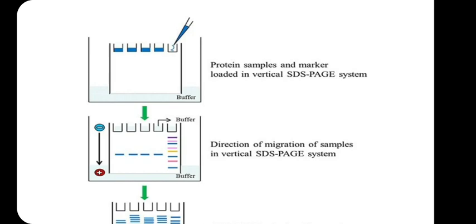And after treating with the SDS, usually the proteins will become negatively charged. But actually each protein will be either positively or negatively charged depending upon the pH of the medium. That's why they are amphoteric chemicals. Except at their isoelectric point, because they carry net no charge, whereas in all other pHs they carry either a positive charge or a negative charge. Because of the treatment with the SDS, they are going to be negatively charged.